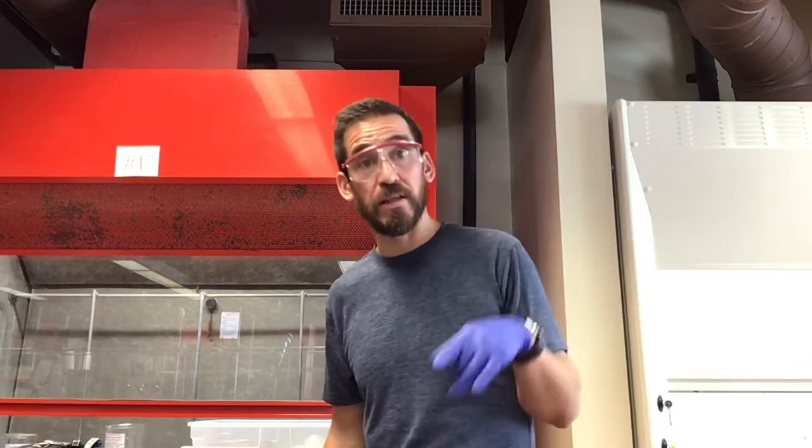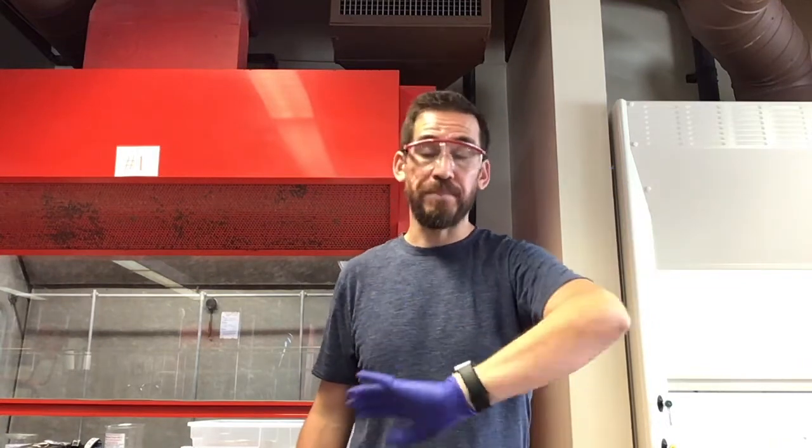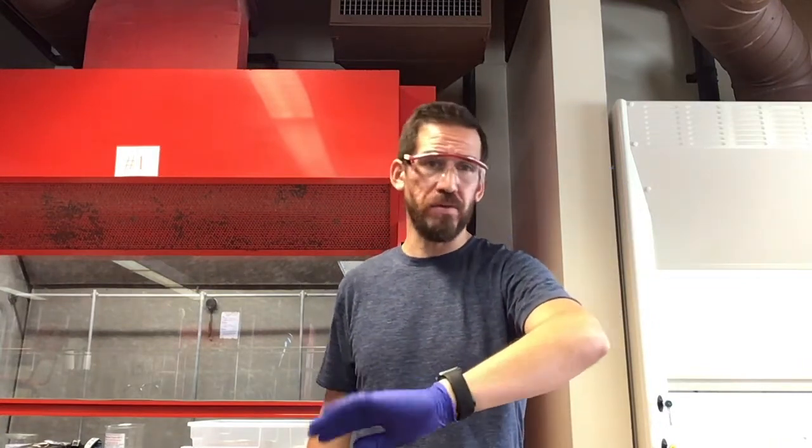So now what I've got to do is clean out these test tubes, and then what we're going to do is the Sn1 reaction. Same exact thing, so hopefully we can run through it a lot quicker this time. And then get on our way, right? So one thing I will say is that this is an Sn1 reaction.